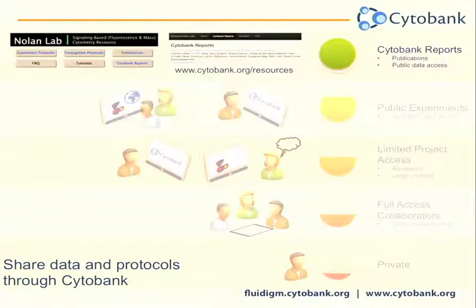The last one I want to talk about is Cytobank reports. Some labs have worked with us to put up whole landing pages as well as reports. So if you want people to look at your data and you don't want them to require a Cytobank login, some of our consulting efforts have been to put up data associated with publications and link to the original experiments on Cytobank. That's basically for people who want to submit a Cytobank report along with their publication and link to it as well.